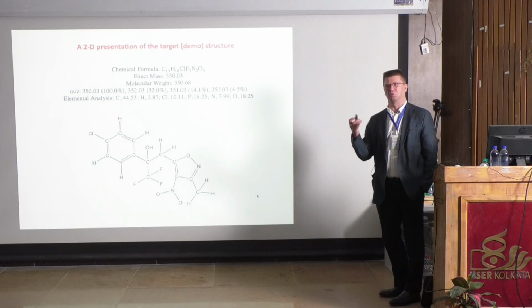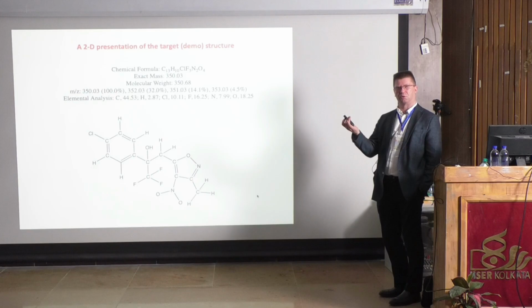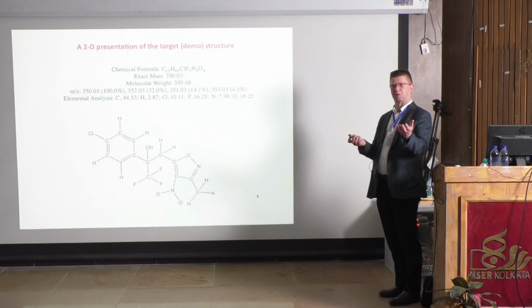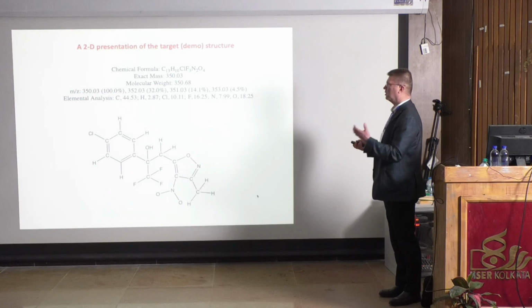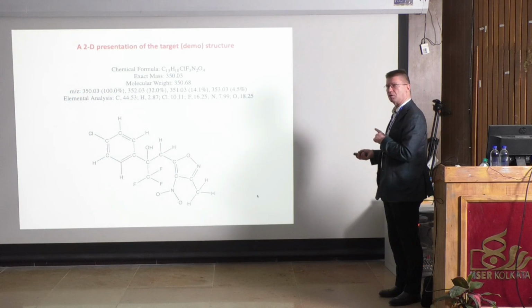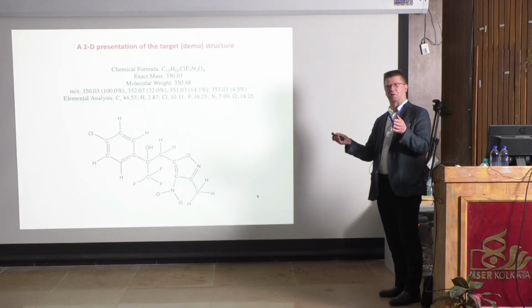We don't know, do we have an optically pure molecule crystal, or do we have a racemate? You remember, a racemate can crystallize also, and the pure enantiomers can crystallize. So in this case, we know that it's chiral, but we don't know if it's a pure enantiomer. And now the question is, if it's a pure enantiomer, is it R or S, or left-handed or right-handed? After that, we will know.